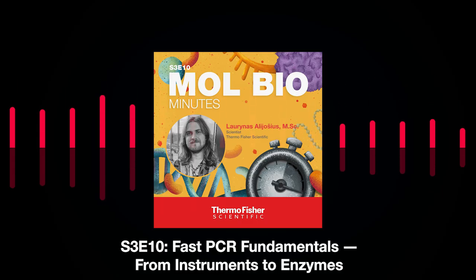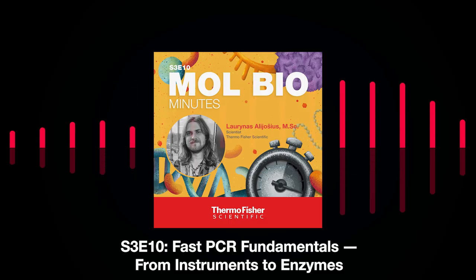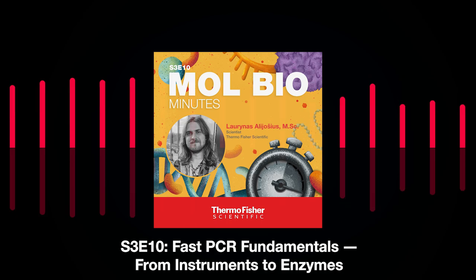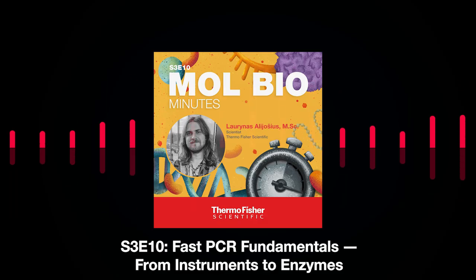If we talk about the high processivity of DNA polymerases, that kind of polymerase can synthesize long stretches of DNA without dissociating from the template strand. So it means that in the end, it would also help you increase the speed of your DNA amplification.